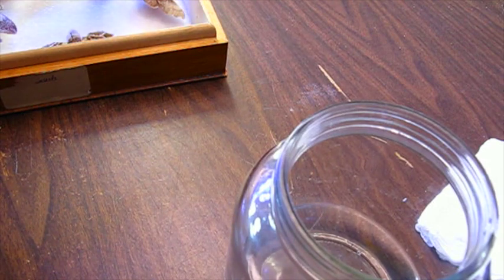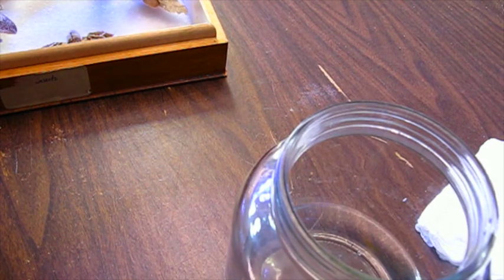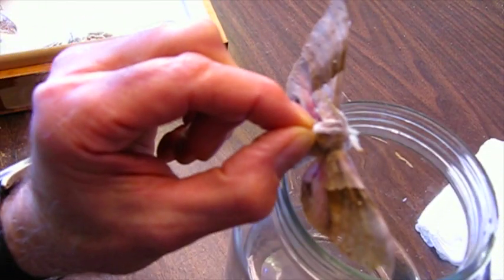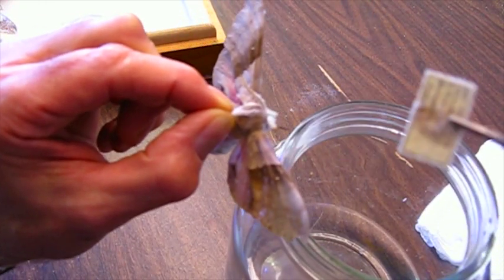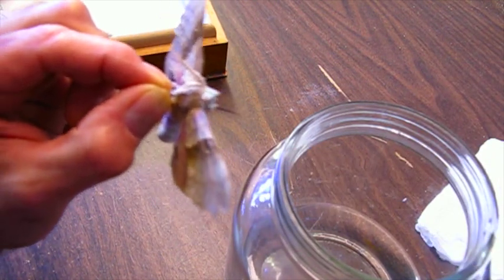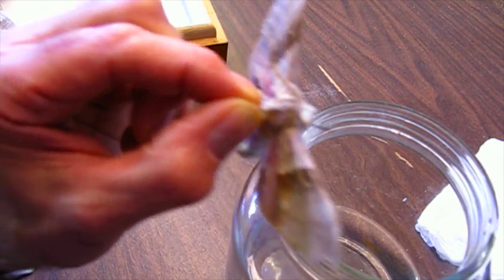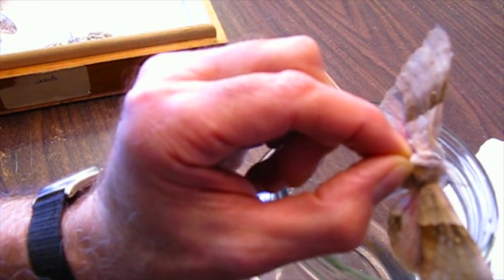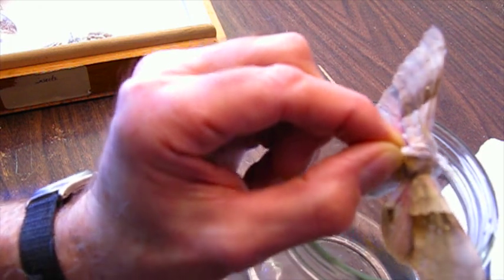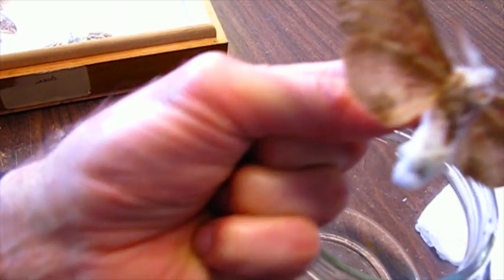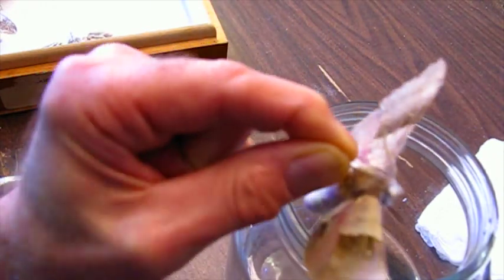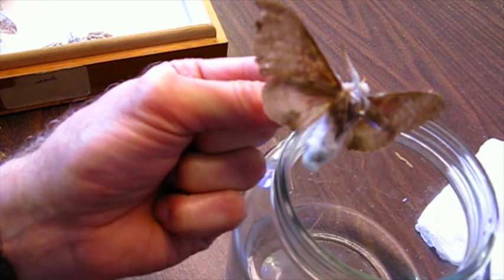Here I'll do one more. This one's really bad. You can't even read the label, it's all just covered with mold. This one is Pachysphinx modesta from Minnesota. Can't even read the date on it, it's so bad. Look how bad this mold is on there. This is severe. The antennas, everything is covered with mold.